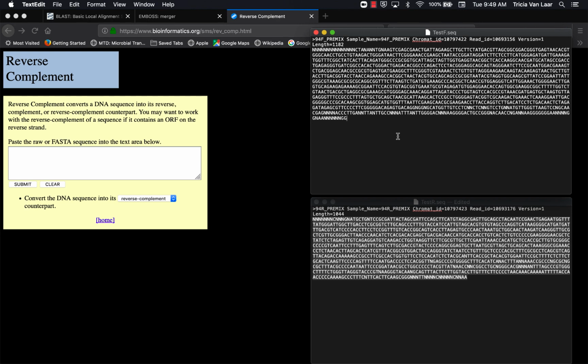If we were able to continue this semester, you would have next run your PCR products on the gel, and I showed you one of the gels in the video from Monday, April 13th, and you could see how bands would look on a gel. The step after that is what's called PCR cleanup. We basically remove all of the primers, we remove all of the other chemicals that allow us to do PCR, and we have a purified DNA product.